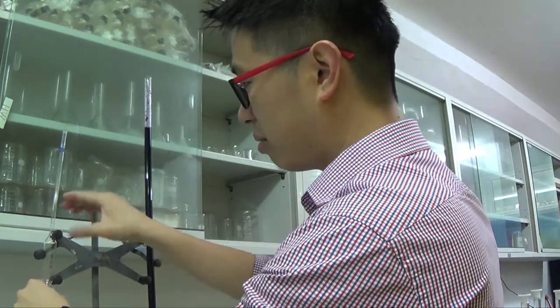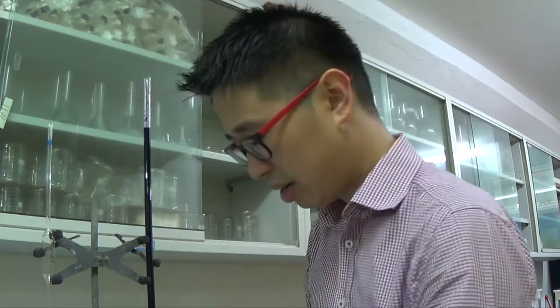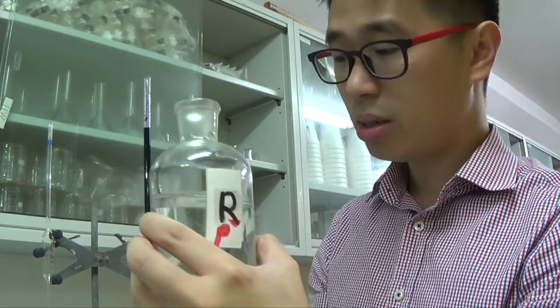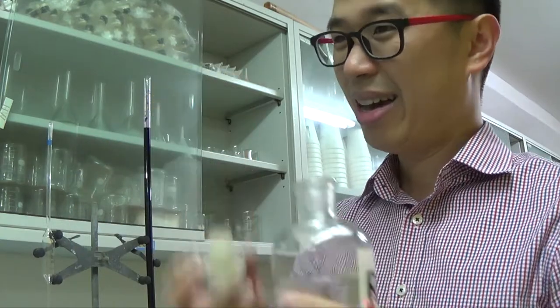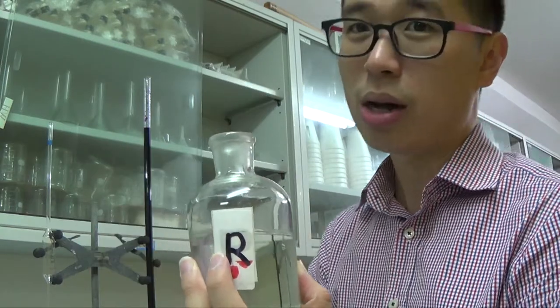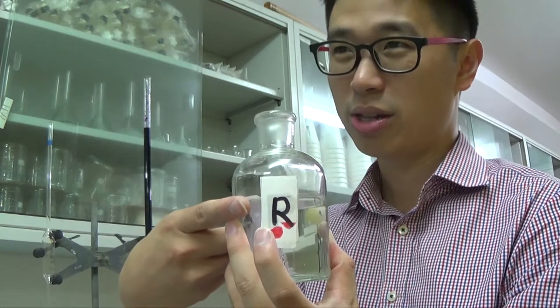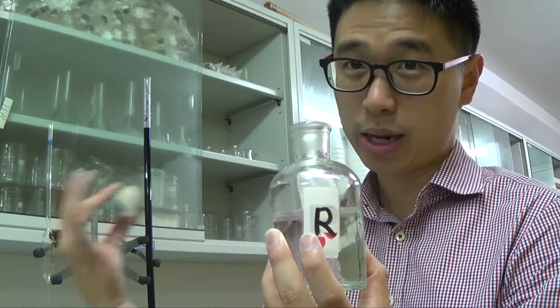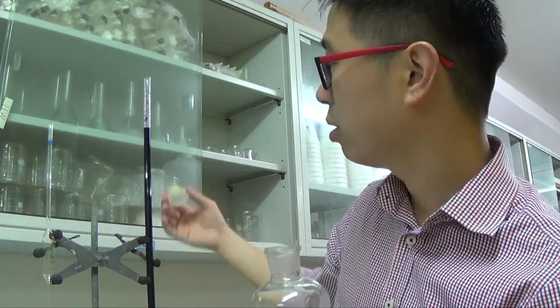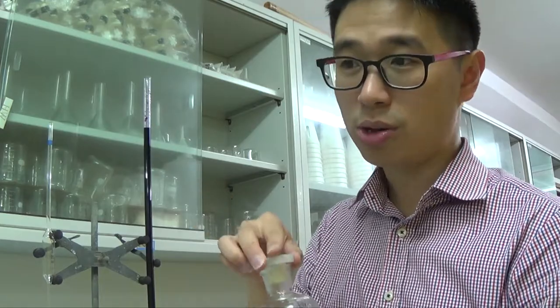Alright. And sometimes they like to ask you as well, in relation to what I said earlier, this comes as a bottle. So you can say a student forgets to close the lid. If a student forgets to close the lid of iron 2, leaves it open overnight, and tomorrow you come back, your titration result could be slightly different because the iron 2 could have been oxidized to iron 3. Right? And you could test it with qualitative analysis because you have done tests for Fe2+ and Fe3+. So if you have less Fe2+ and more Fe3+, that means you will have a lower endpoint because you just need less of the KMnO4 to oxidize the remaining Fe2+, right? In the same 25 cm3.